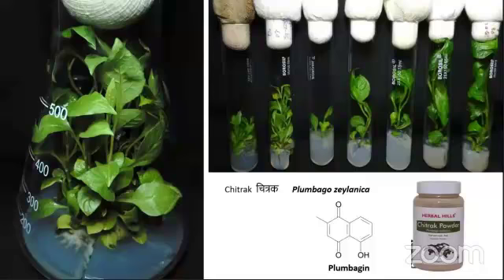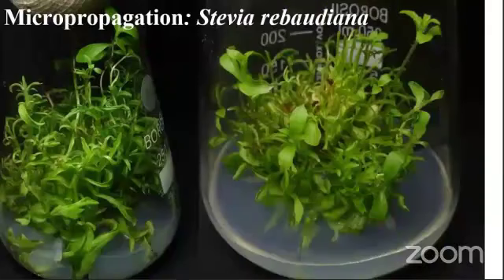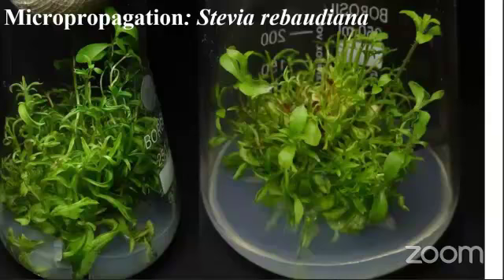We also develop our system in our lab with Plumbago zeylanica, particularly for plumbagin production, both in the tissue culture system as well as the cell culture technique. And you see here the stevia very nicely propagated and multiplied in our lab in the culture vessels, with a huge number of multiplications, for large scale production of stevia.